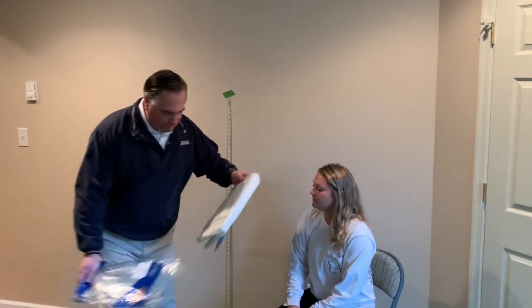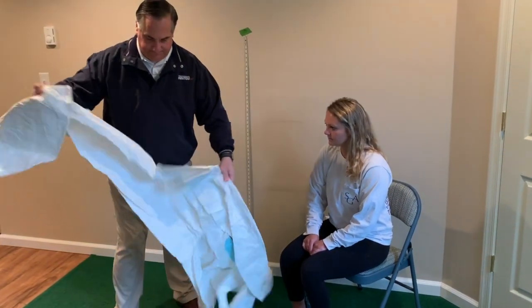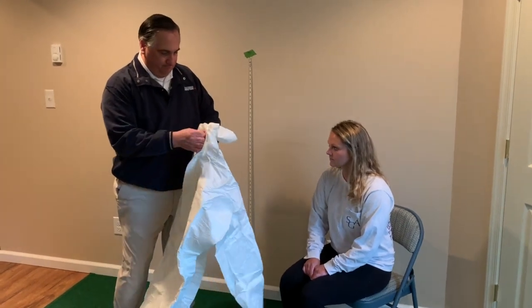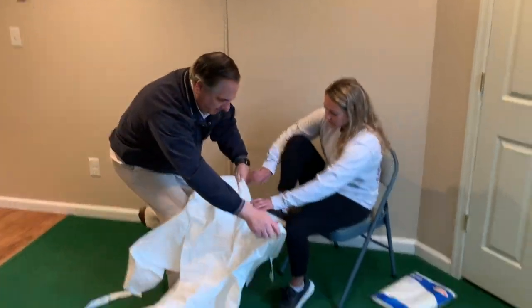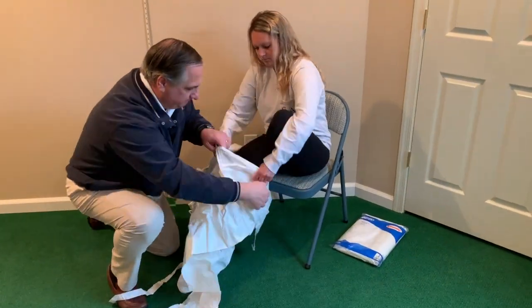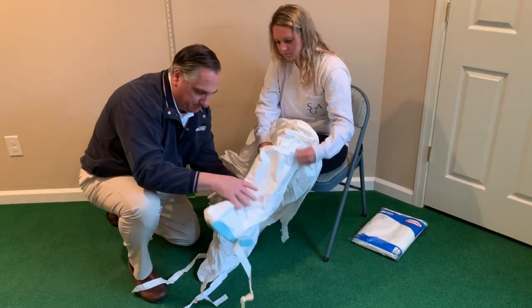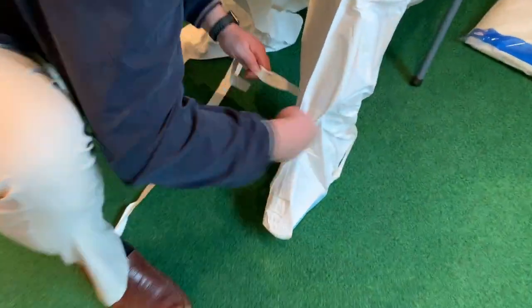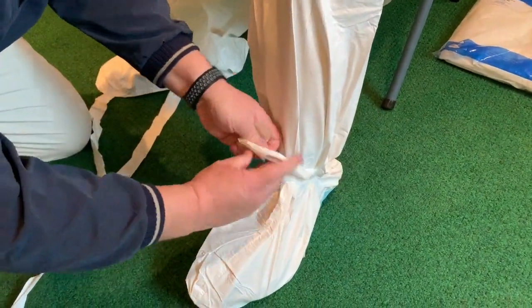All right, here we're doing a 5X suit. You want to make sure that your feet are all the way into the coveralls. Then you make sure that you take those laces and you tie your ankle snug to eliminate all of the extra material.